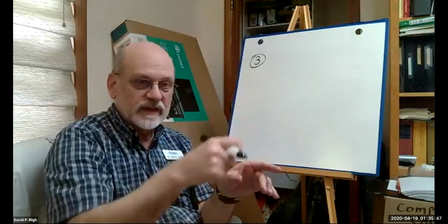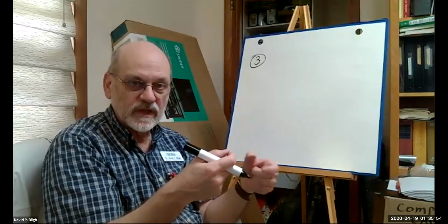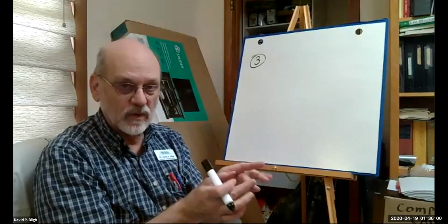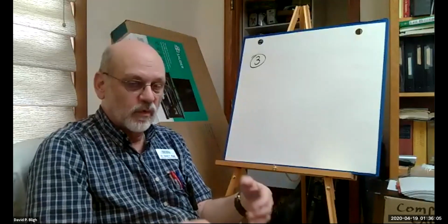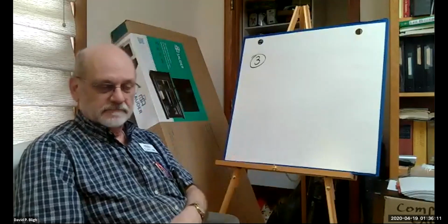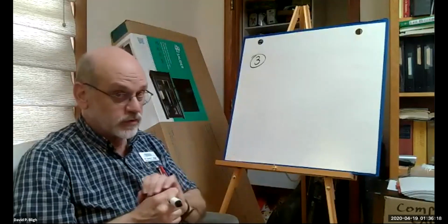If you accidentally, your hand shakes and a piece of the material ends up on the pan and not in the cup, in the weighboat, then you're getting the mass of both, but when you go to put it in your tube, you're not putting all of it in the tube. You left some of it on the balance, right? So that would come under the general category of spillage. Right? You don't have what you think you have.